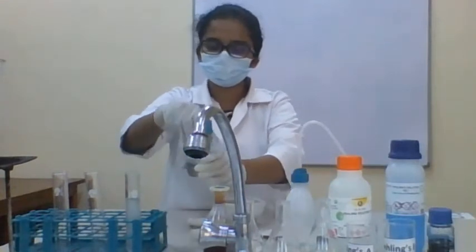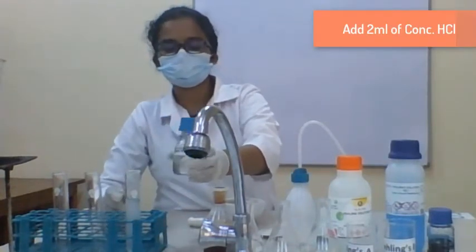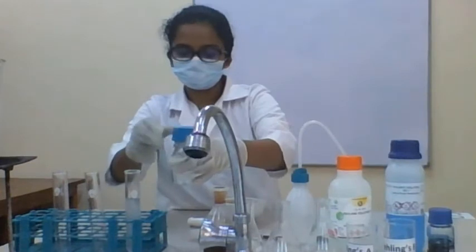And then I'm going to add 2 milliliters of conc HCl.